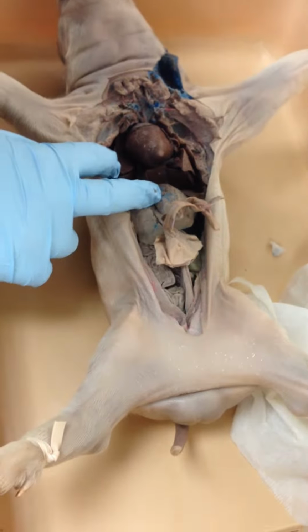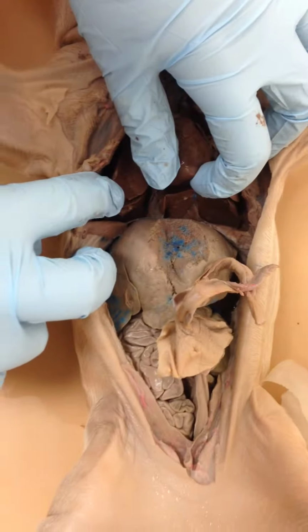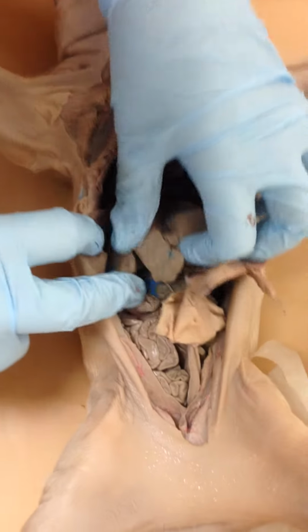Okay, so this is our fetal pig dissection. The first thing we're going to look at is the ductus venosus. That is through the liver. Through the liver. You can't see it.